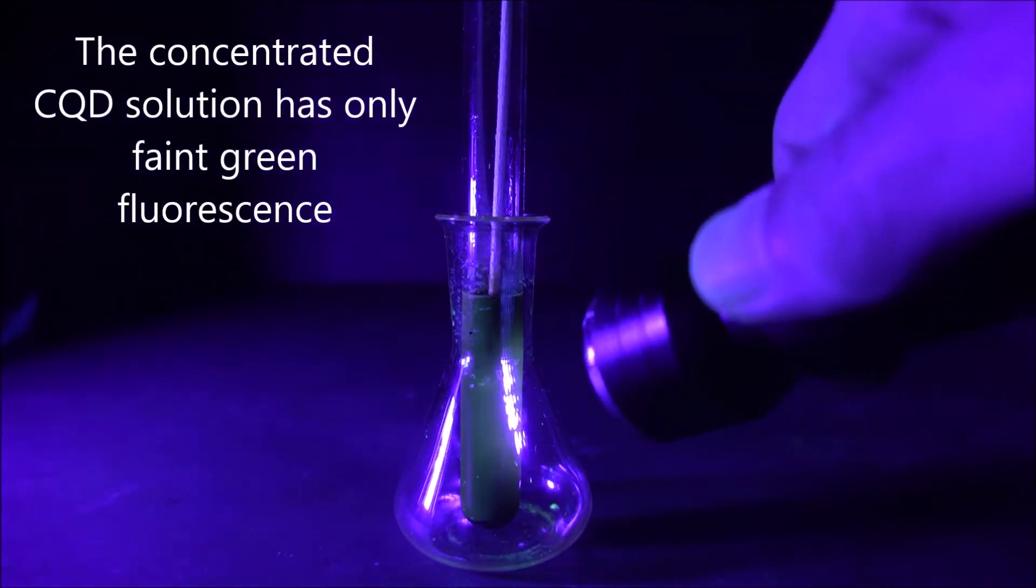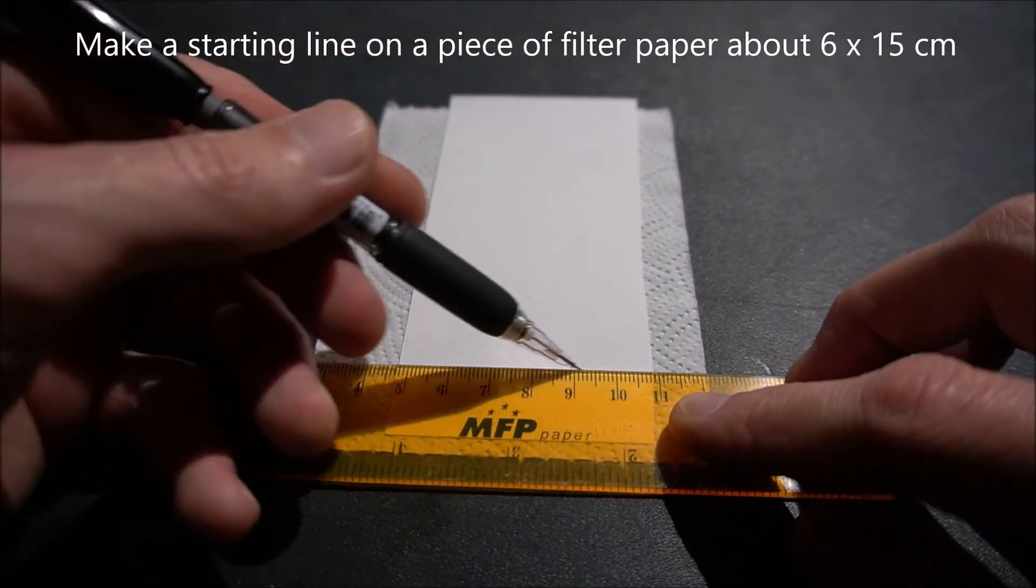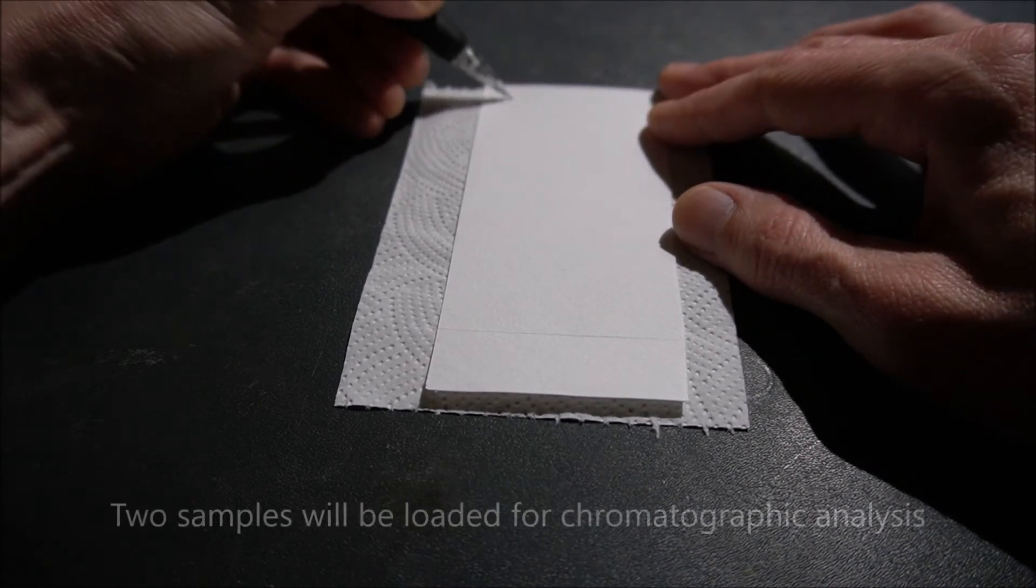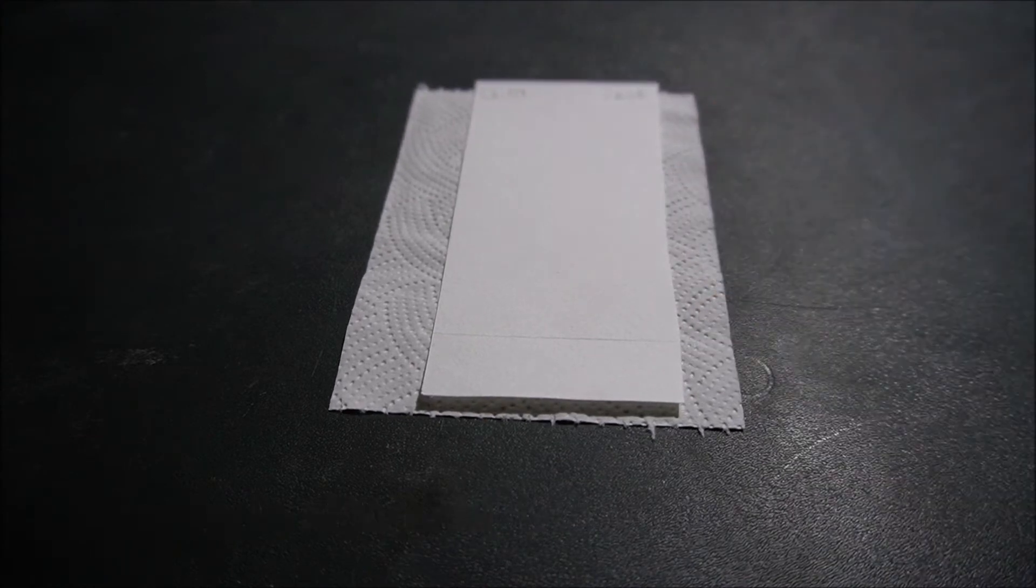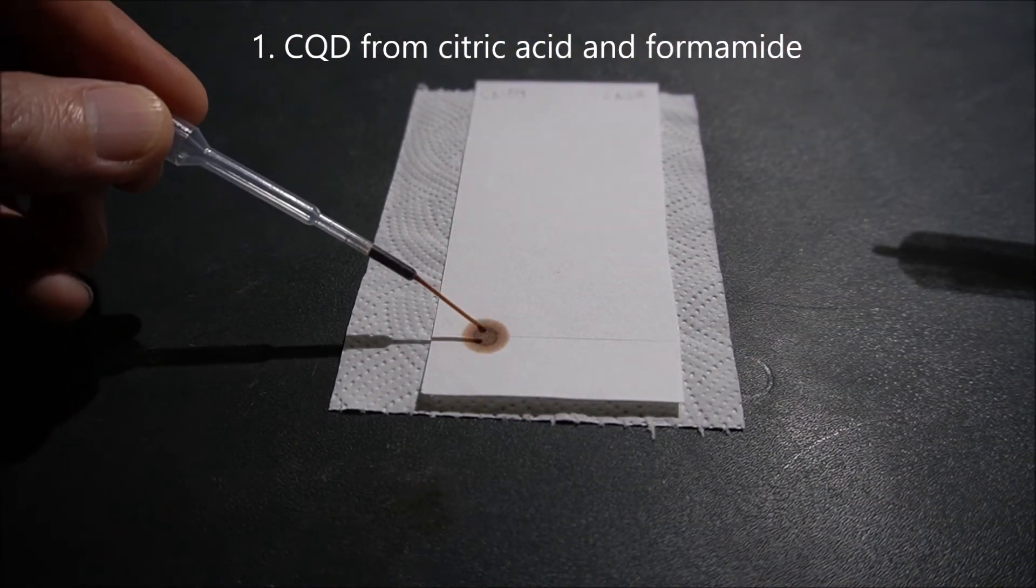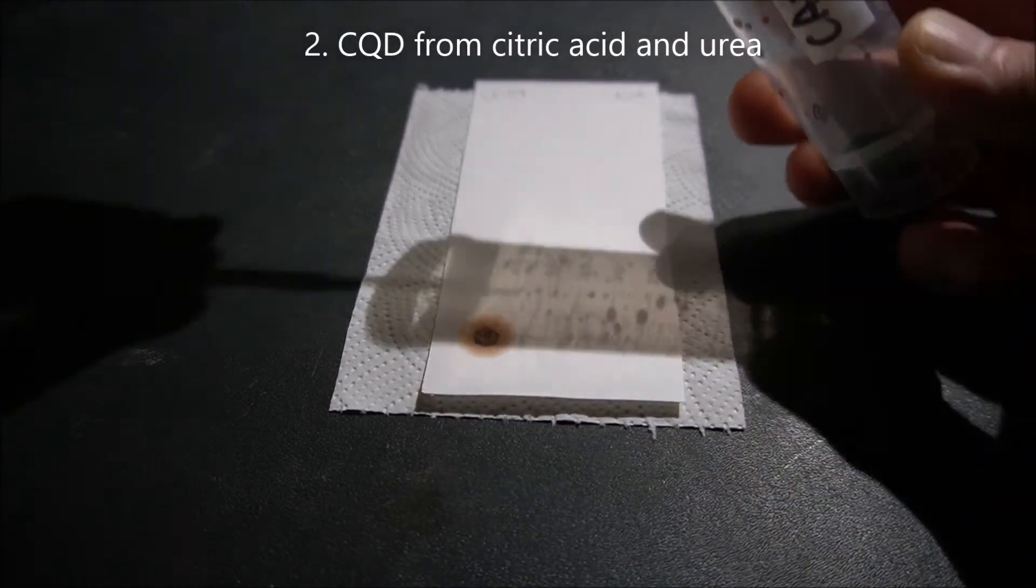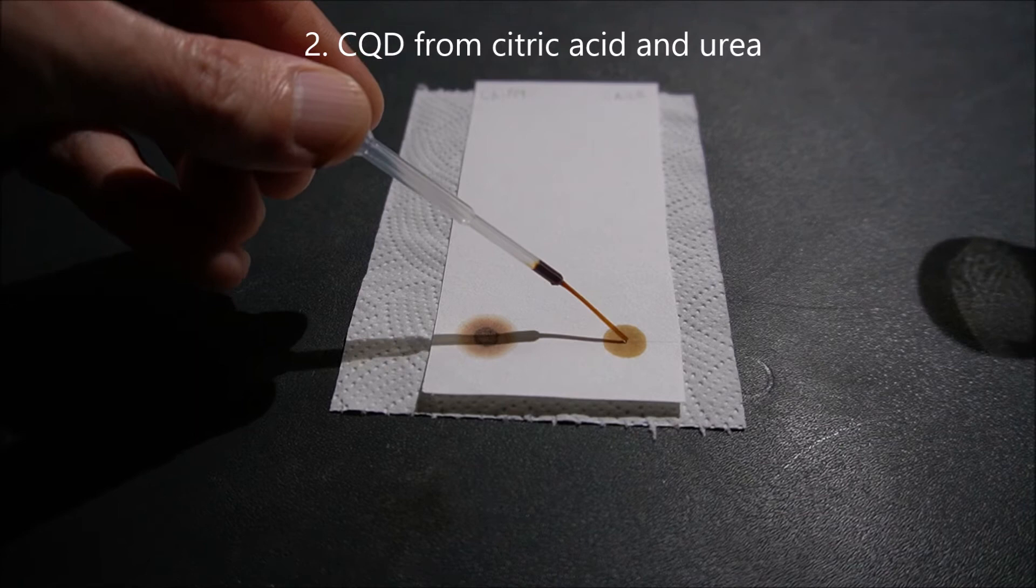The concentrated solution has only faint green fluorescence. Use a pencil to draw a starting line 2 cm from the edge of a filter paper cut to 6 x 15 cm rectangle. We'll load two different samples of carbon quantum dots for chromatographic analysis: the ones we just made from citric acid and formamide, and the others from citric acid and urea which were made in a separate video.